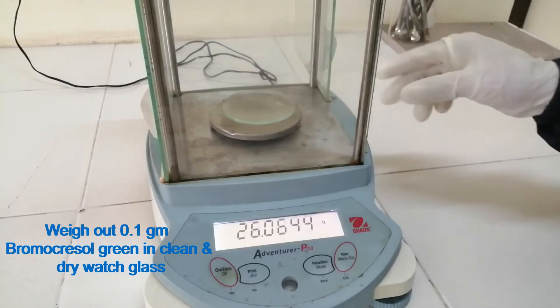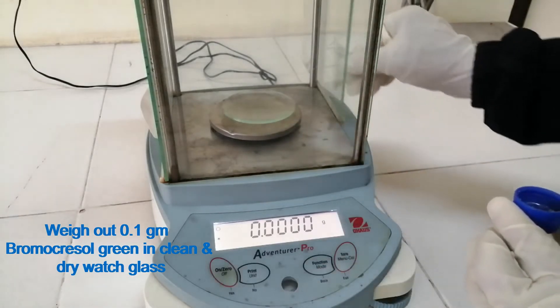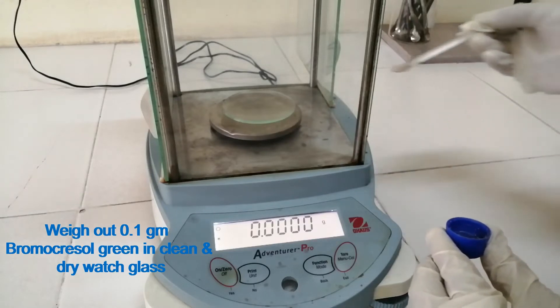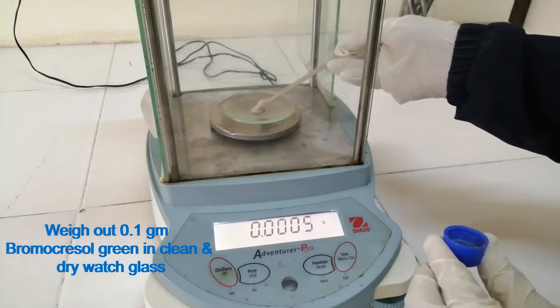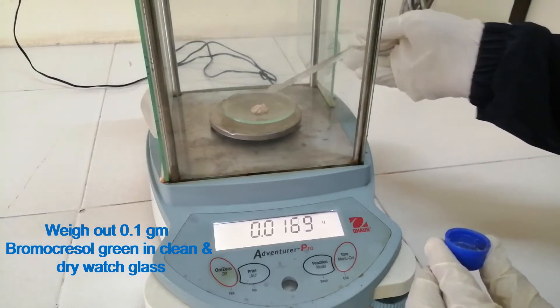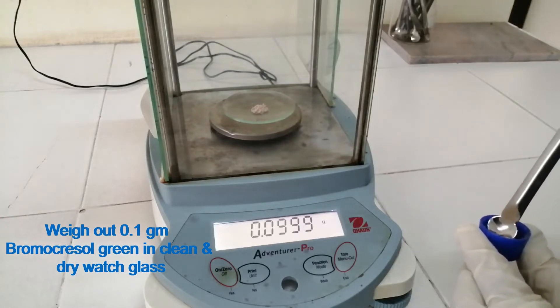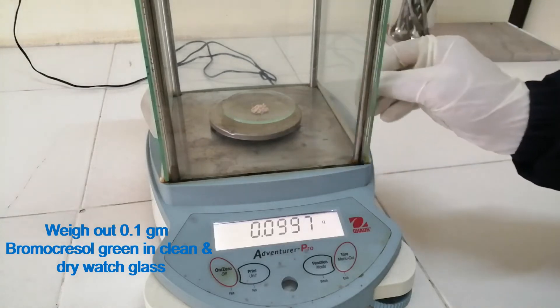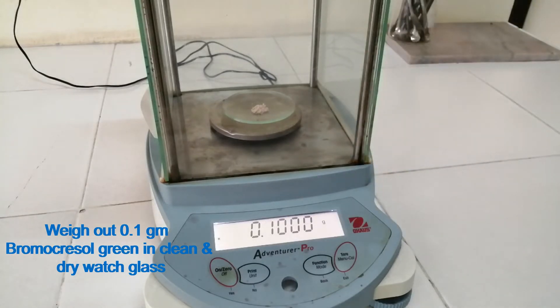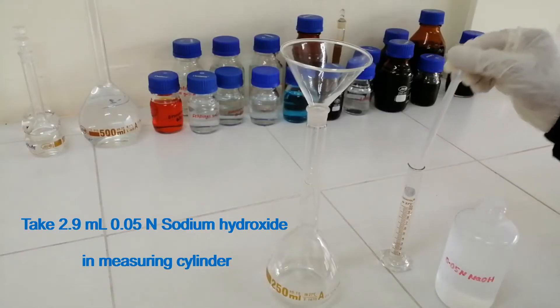Weigh out 0.1 gram Bromocrysol Green Powder in a clean and dry watch glass. Take 2.9 ml sodium hydroxide in a measuring cylinder.